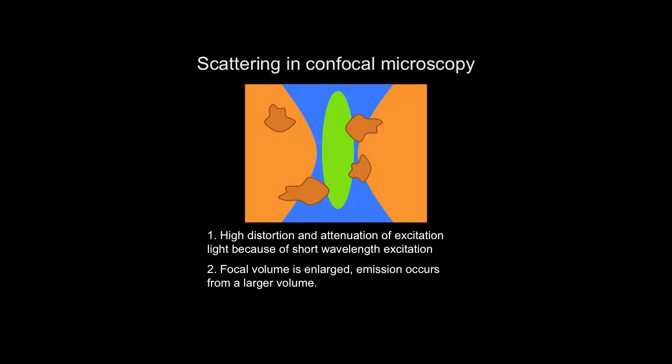enlarged. We talked about that when we explained the relationship between interference, coherence, and scattering: how the coherence phase is affected, and then the waves lose the ability to interfere, and then the confocal detection sees only the ballistic photons because of the confocal arrangement.